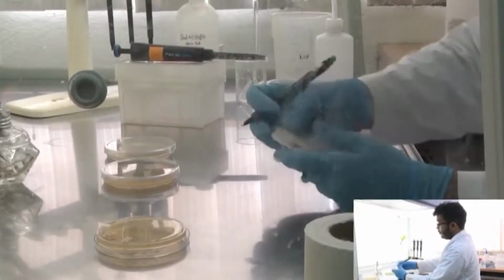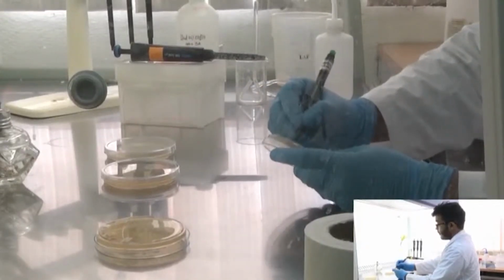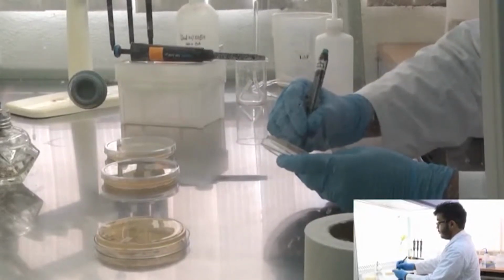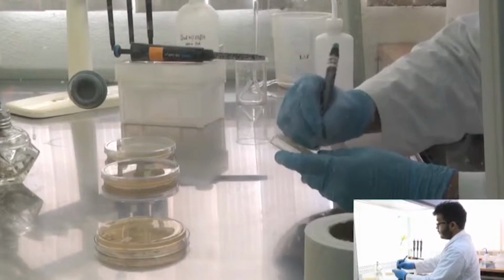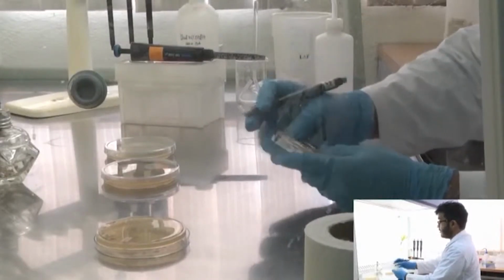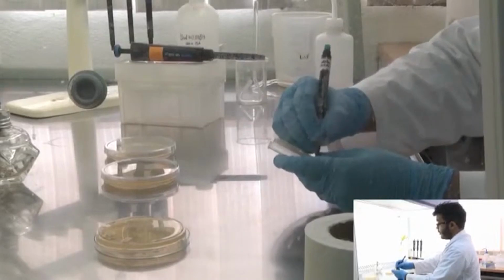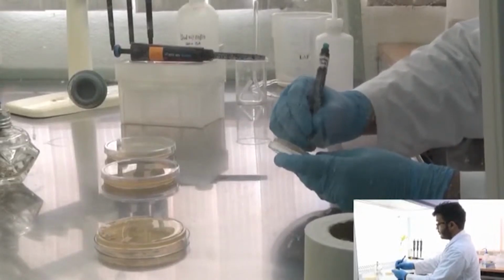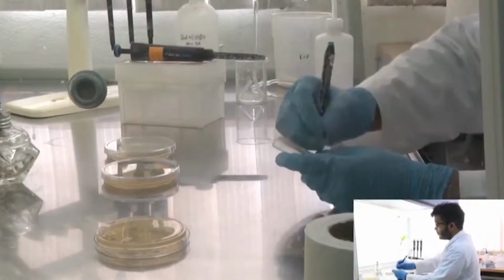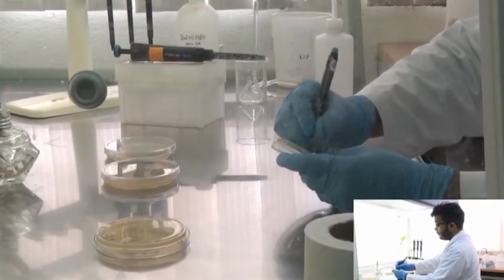I'll just label all 4 of them. And meanwhile, if you remember, we have been growing our transformed bacteria with LB in the 37° shaker incubator. So it's almost 1.5 hours. There is some time left.